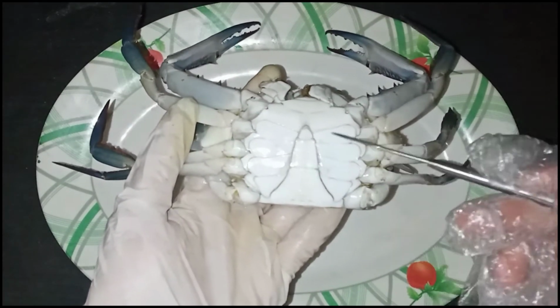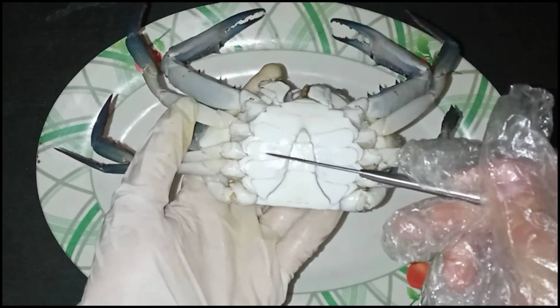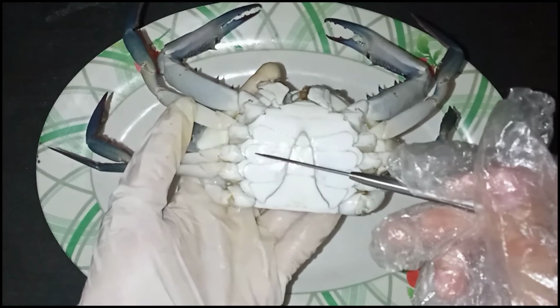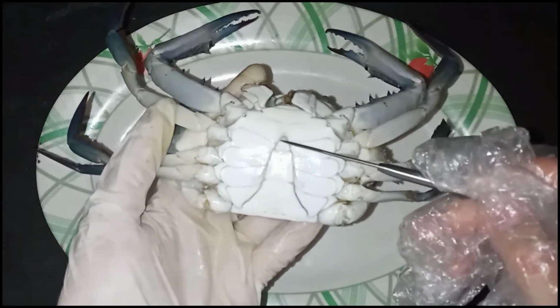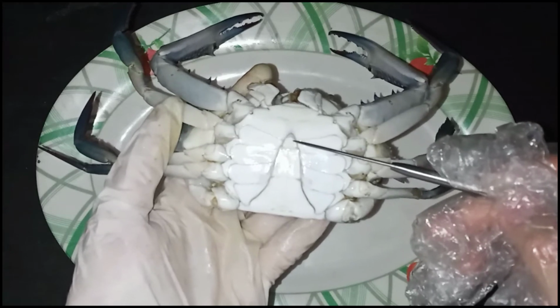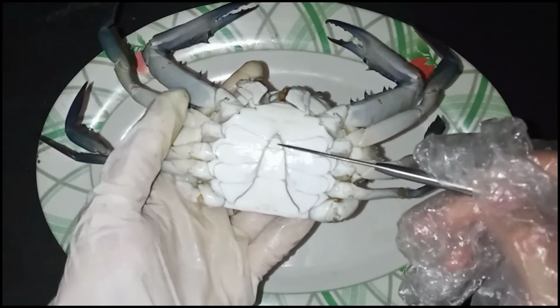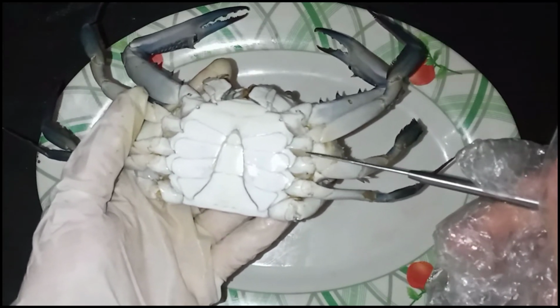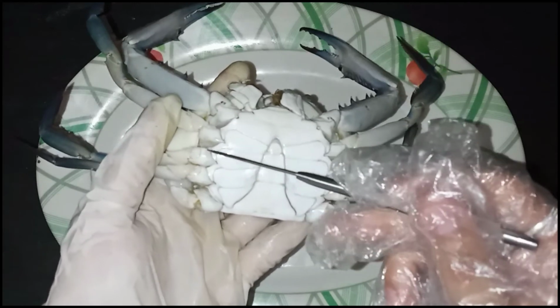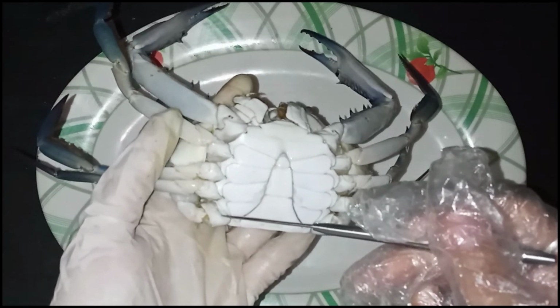These small segments on the ventral side of the crab are called sternites. These parts are called the coxae, where the pereopods are attached.